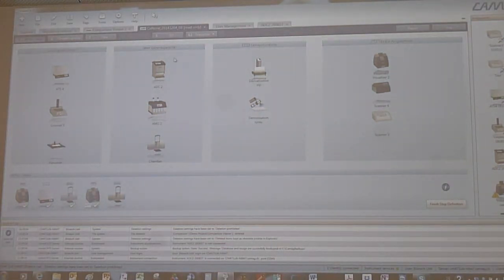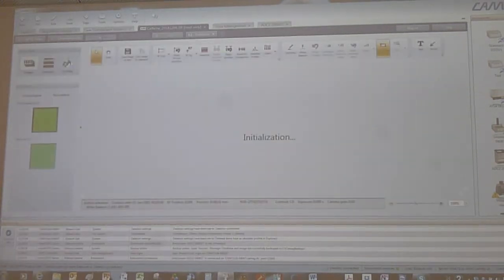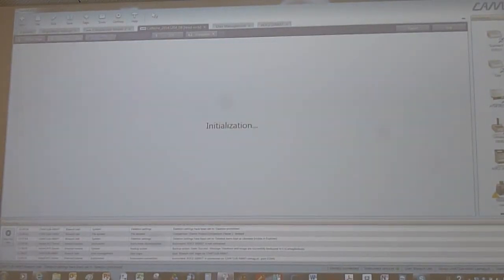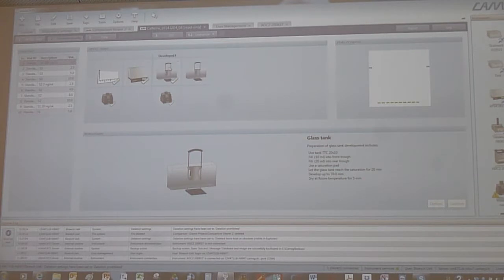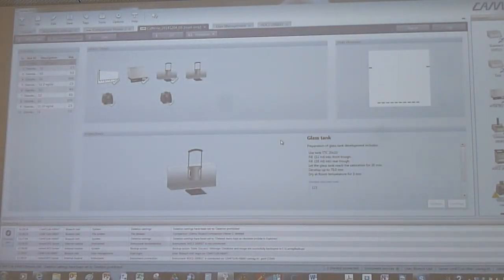So what we did now is, if we have something like an analysis, and now I activated this, I have here the data. So I want to change some items here. ABC here. Okay. Then there is another. No saturation, that's going up there, down, just some. So you see, I have to enter nothing at all.